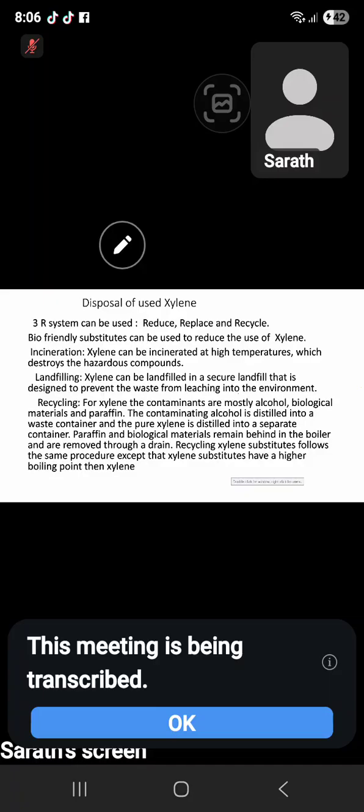After burning, it should not come to the ground level, so you can use an incinerator with a very high chimney. Otherwise, you can hand it over to places like Siliconaro. There are commercial agents who buy and take those things.